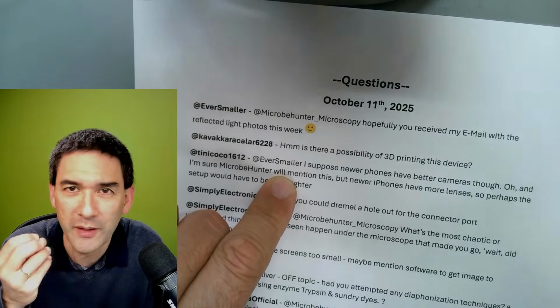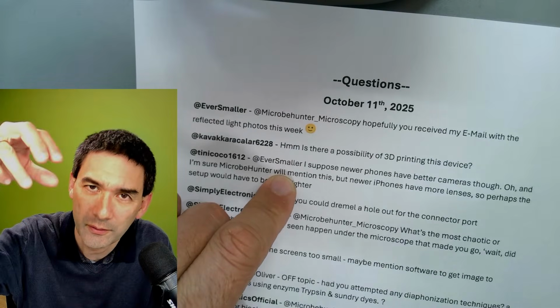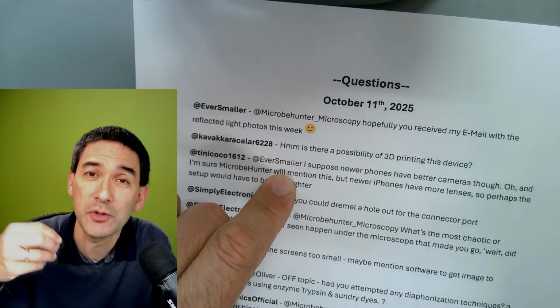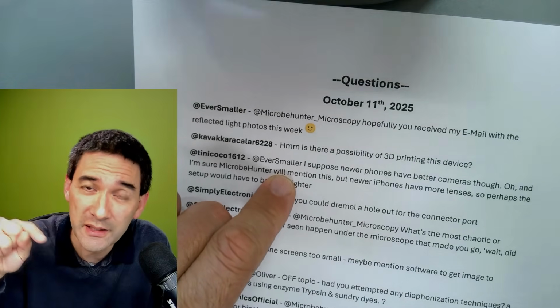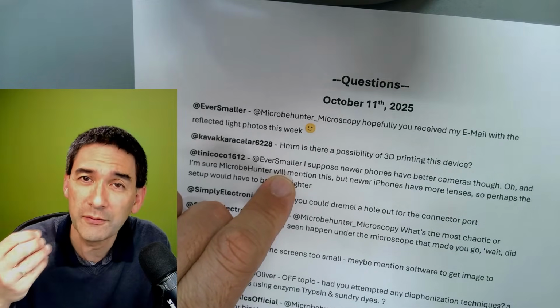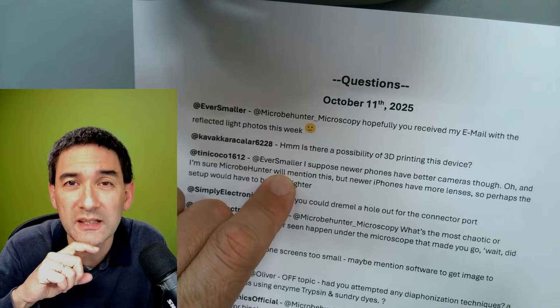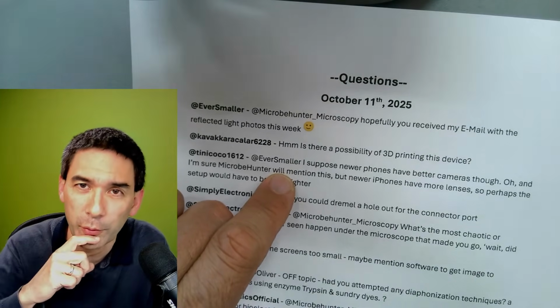I was kind of wondering, how can this be, right? And then I took the camera from the photo tube and I put it also on the eyepiece, and then the image quality was also much better. And then I figured out the reason why. Because inside the microscope there are so many optical elements, mirrors and everything. They have degraded the image quality so much that I actually got significantly better image quality by using a mobile phone through the eyepiece than over the photo tube.